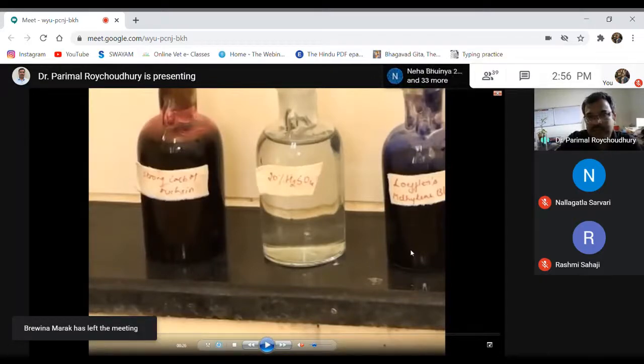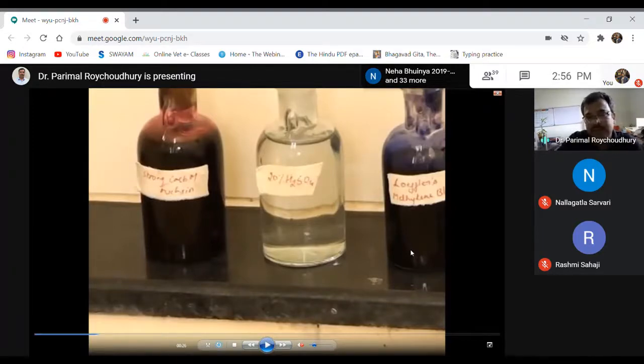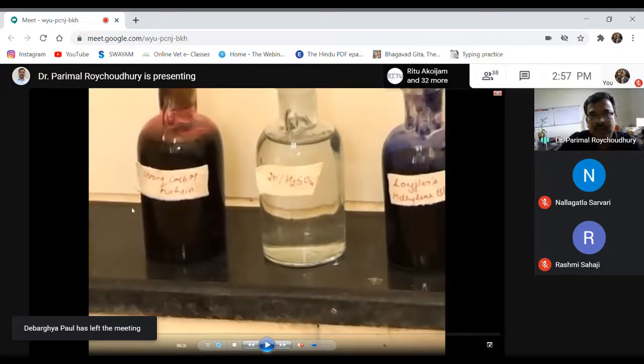And moreover, in this staining technique, you can see the persons are doing the staining without wearing any gloves. It's not recommended. We need protection for the eyes by wearing goggles, and we should use gloves to protect our hands, because this strong carbolfuchsin can immediately impart color to our body cells. Using 20% sulfuric acid is also risky, so we have to be careful.